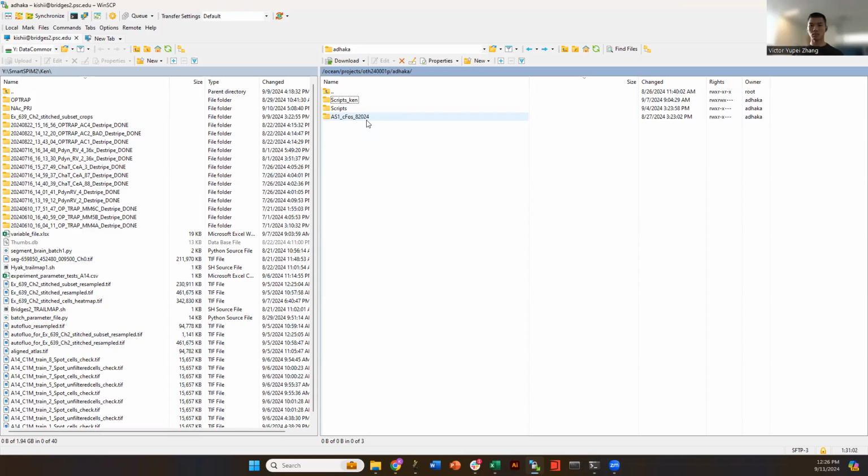A false positive rate will be the amount of cells that were counted in ClearMap but not in the manual. The false negative rate will be the cells that were counted in the manual but not in ClearMap. Using those metrics, ultimately you can calculate something called an F1 score that reflects both the false positive and negative rates. That will be, I think, a good metric to quantify the performance of your classifier, right?